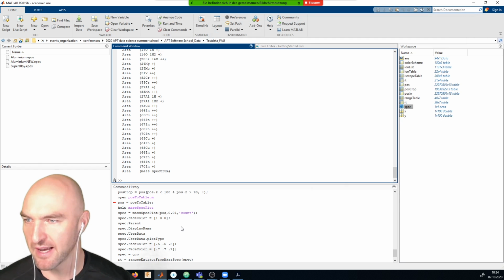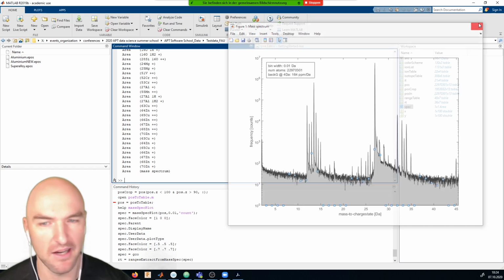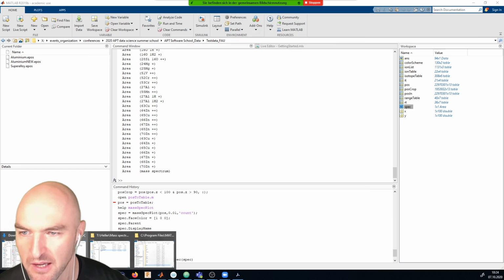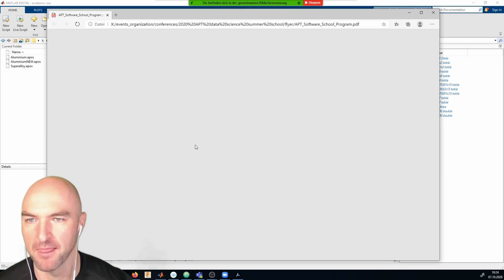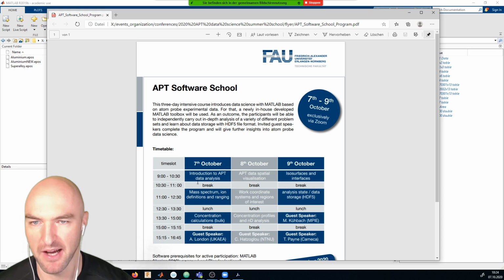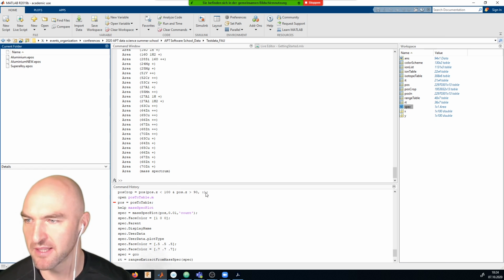And with that, I actually will conclude the first session. And we will have a short break. Let me just have a look at the program. So now we're going until 10:30, and then we'll have a half an hour break until 11 o'clock. And then Martina will start with the mass spectrum, ion definitions, and ranging. So then we will show you in depth about how to build up a mass spectrum like this.